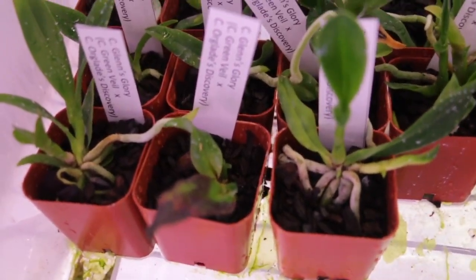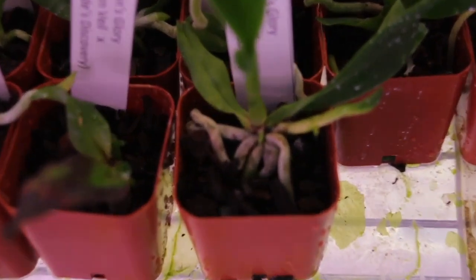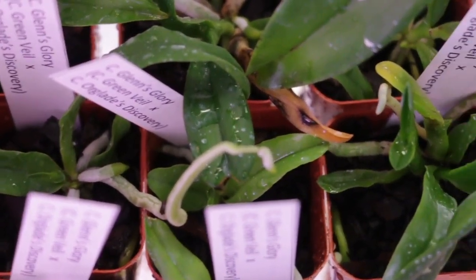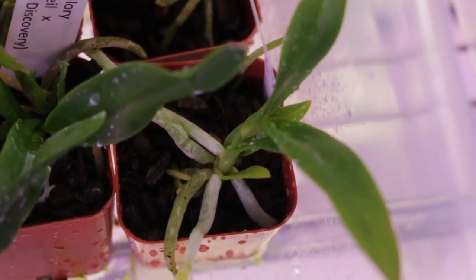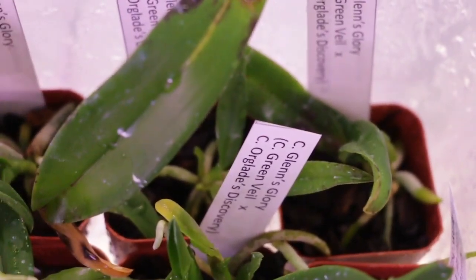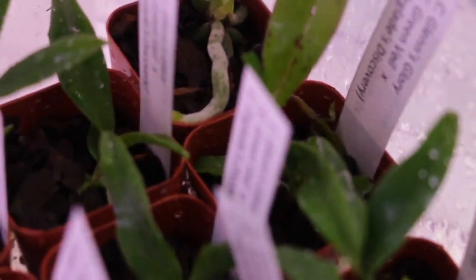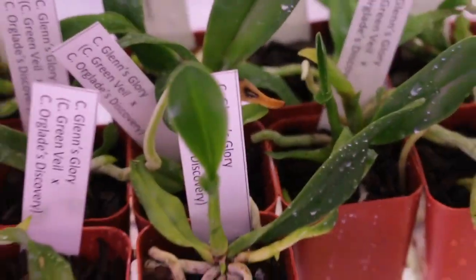Finally, I've got another hybrid right here that was deflasked the same day as that last flask that I showed you. These were big plants, but you can take a look at the root systems that are growing out of these plants and how really spectacular they are, if the camera will focus for me. Look at that, that's a nice root system, and what you may or may not be able to see on these is that there are also a lot of new pseudobulbs coming out of it, which is really kind of shocking and surprising to get that much fast growth out of these seedlings.